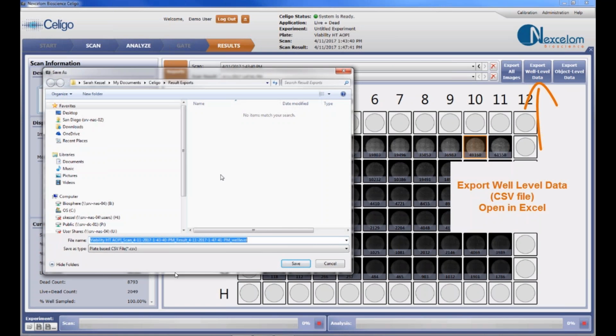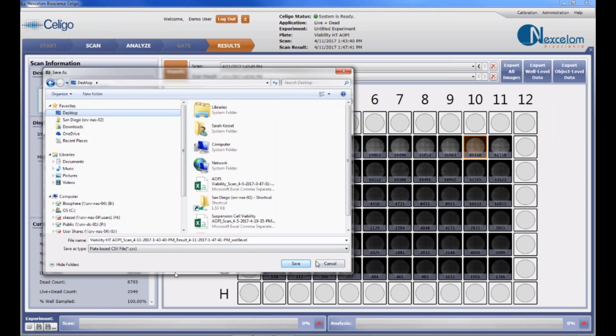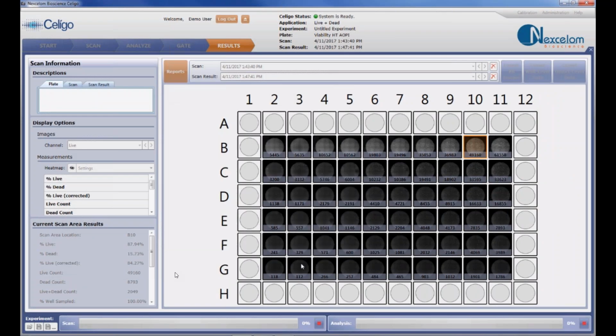And so I'm going to show you next how to back calculate it into a cells per mil concentration. And I want to show you also with our dilution factor where you can start to see you can have confidence in the cell dilution factors.